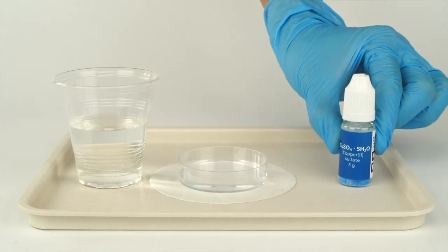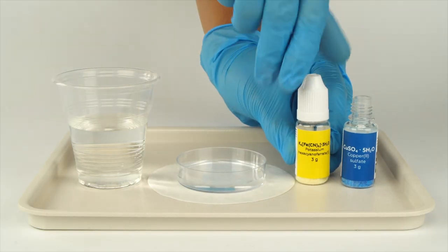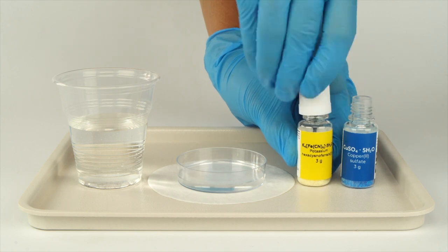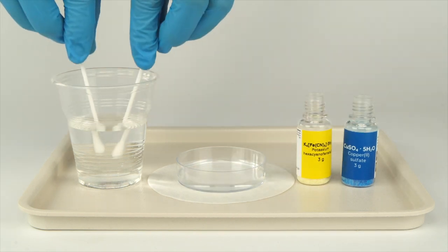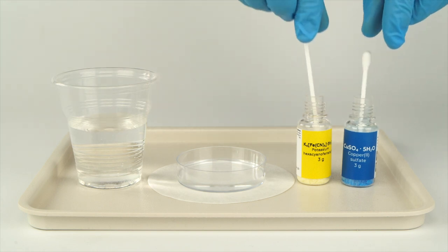Open the bottle of copper sulfate with the blue label and the bottle of potassium hexacyanopherate 2. Dip the two cotton swabs in water, then dip one wetted cotton swab into each reagent bottle.